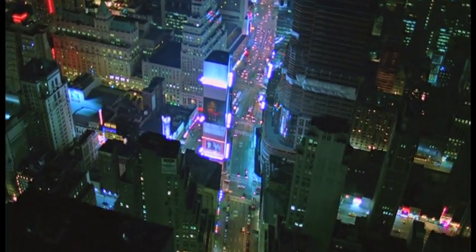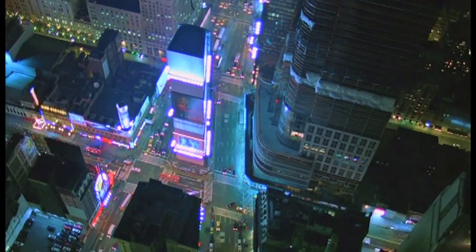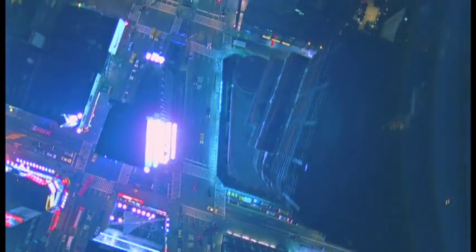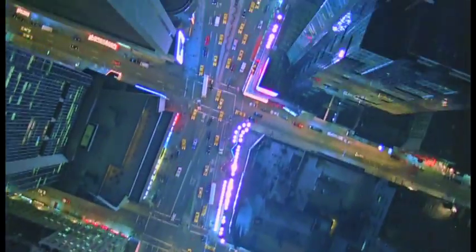Bringing in additional perspectives allows you to acquire more information. But that still might not be enough to see everything without interference or distraction. That requires orthogonal perspectives.